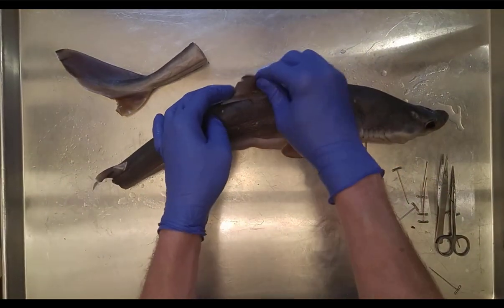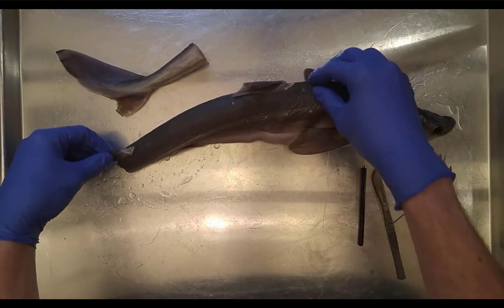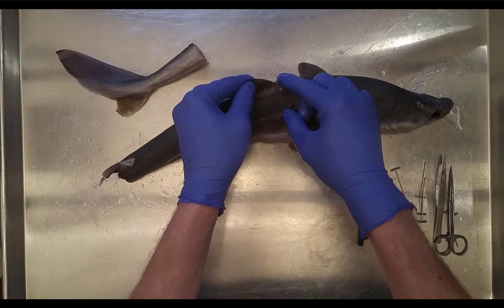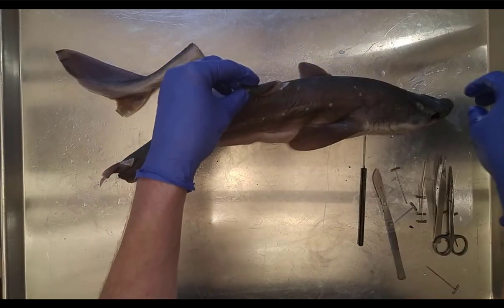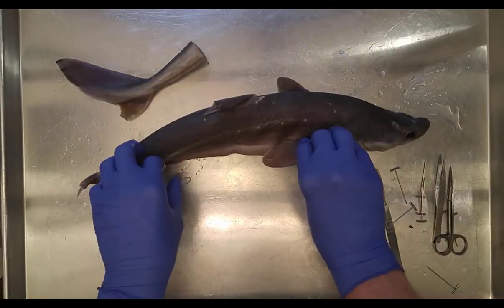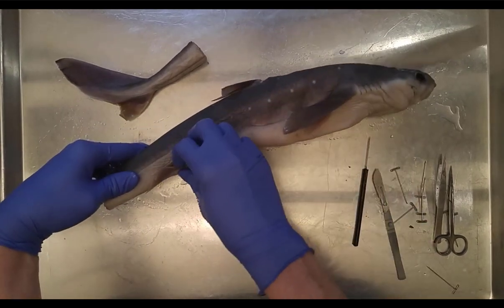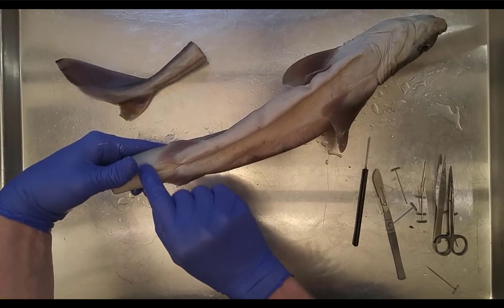We can see the anterior dorsal fin and the posterior dorsal fin. Both are clipped because they often come with spines for protection — there's a little spine on each. Then we have pectoral fins and pelvic fins. Make sure you know all the fins: anterior dorsal fin, posterior dorsal fin, pectoral fins, pelvic fins. On males, the pelvic fins would have two claspers.